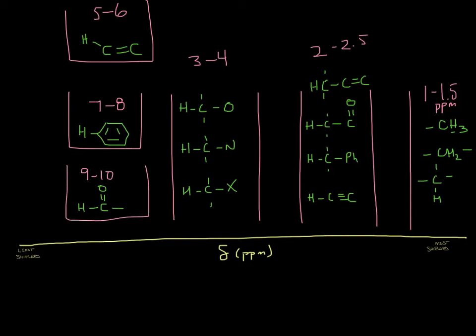And the least shielded hydrogen of all would be the hydrogen of a carboxylic acid. Carboxylic acids are acids, meaning that that hydrogen essentially has no electron density of its own. So this would end up at the far left, usually in between 10 and 12 ppm. So that guy is really the least shielded of all. It really has the lowest amount of electron density.